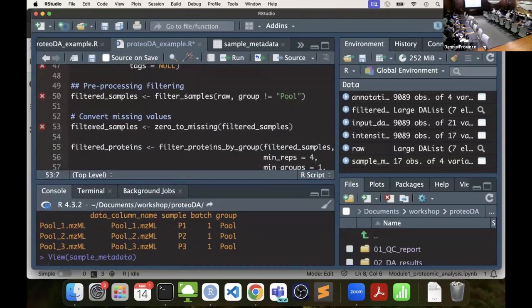Okay, so the other key point, and this relates to how we deal with fold change in the limma model later. We have a function called zero to missing. Right now, anything in my data that has a missing value is coded as a 0. Limma can omit zeros if they're flagged as NA instead of 0. So here I'm changing anything that's a 0 to an NA value. Other programs use NaN, but here it's not recognized. It has to be NA.